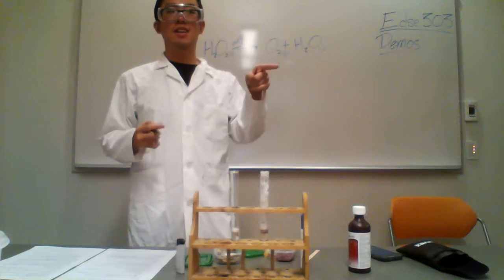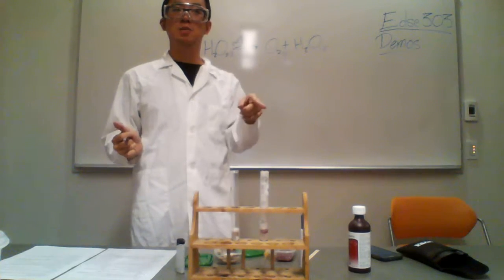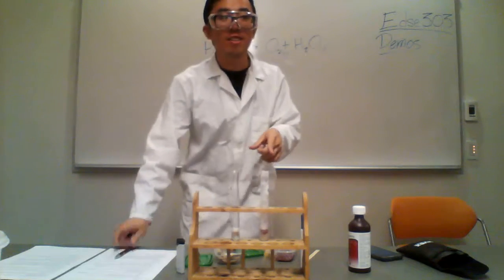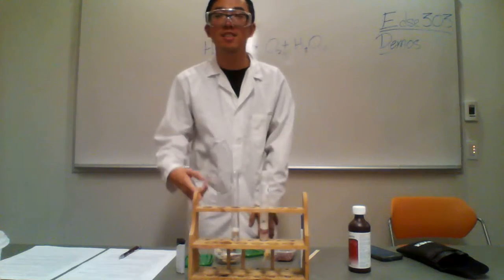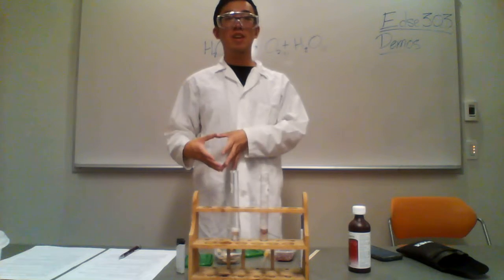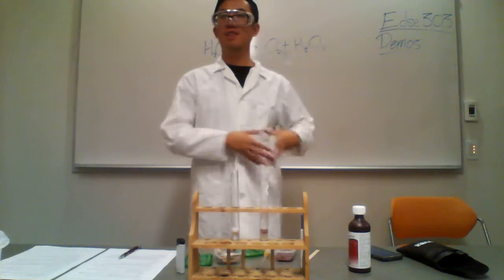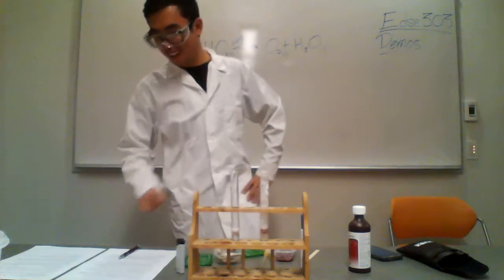Detoxify stuff. Exactly. And what is hydrogen peroxide? Toxic. Exactly. So the liver is actually reacting this aggressively because that is where most of the enzyme catalase is located. I actually am not sure if this is where the liver is in the body. I'll get back to you on that, kids.